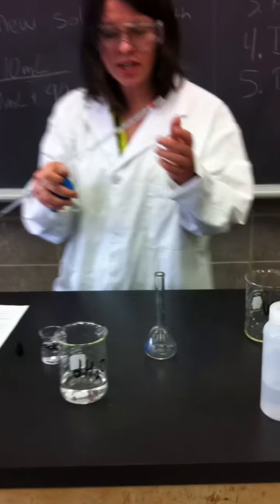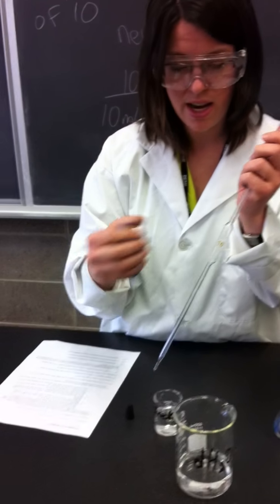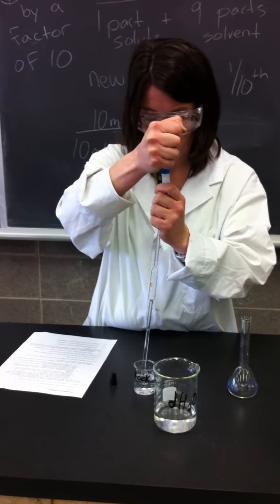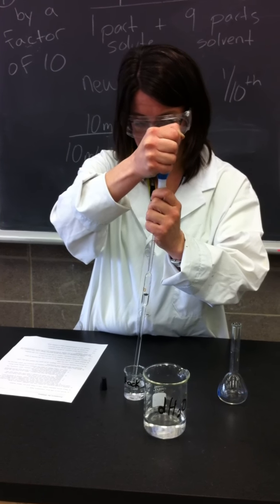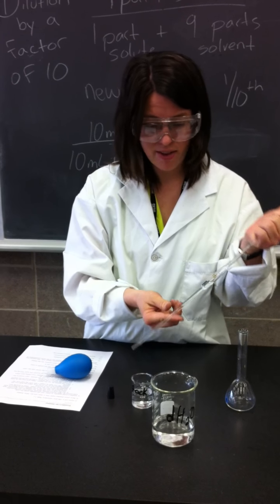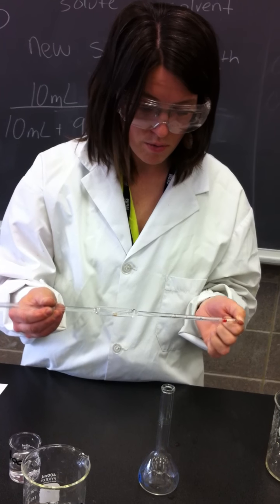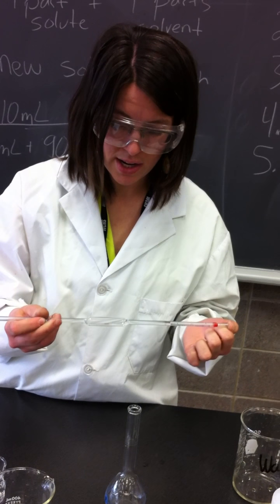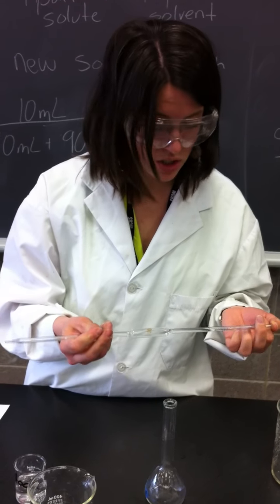All right, so I'm gonna season this pipette, to make sure that we have the same concentration in the pipette as the stock solution. So I'm going to take up some acid, and I'm going to be fairly careful because, of course, I don't want acid everywhere and on my fingers and so on. So I've got about half a pipette of acid, and then I'm just going to roll it around. I'm rolling it so I'm getting all of the pipette covered with my stock.